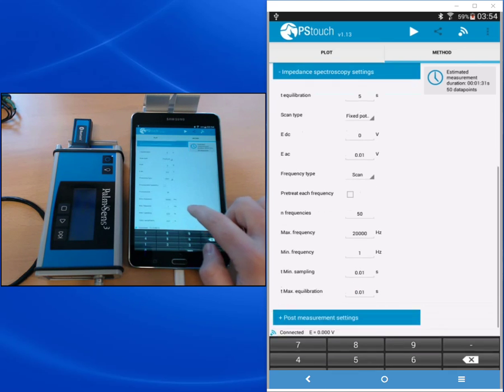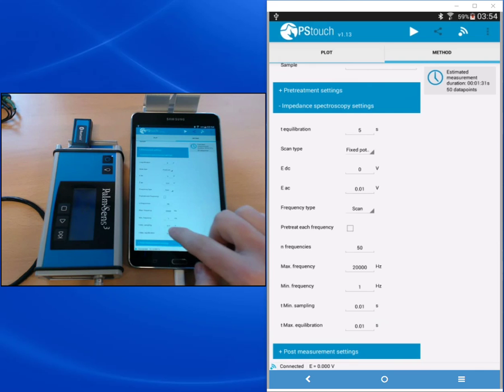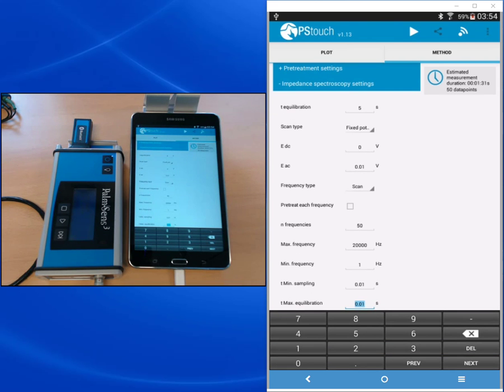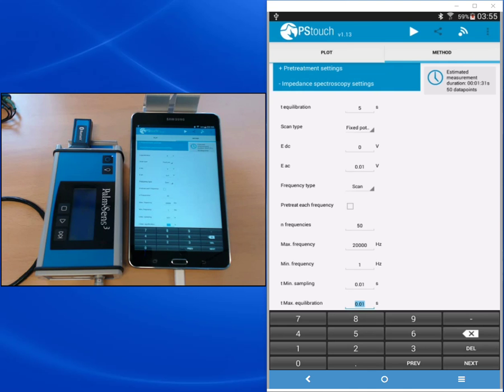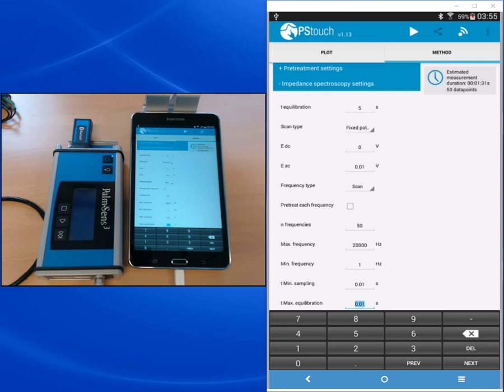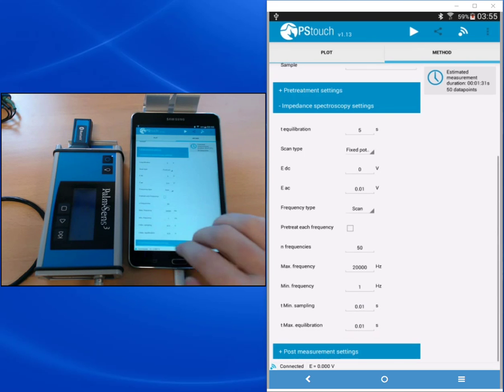The maximum equilibration time determines how long the system waits before it actually starts with the sampling. The two criteria for that are five sine waves or the maximum equilibration time, whichever is reached earlier. So at high frequencies five sine waves take very little time, so most likely this criteria will kick in. For lower frequencies it takes very long to make a single sine wave, so after the maximum equilibration time the system will just be sampling although there weren't five waves collected.